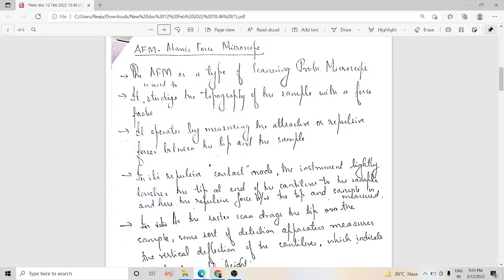As we had discussed in our previous session, in the scanning probe microscopy technique, a probe, which is usually a metallic tip, is placed just above the surface whose structure has to be studied, and based on the interaction between the probe and the surface, which is monitored, we can determine or image the surface topography of the sample.